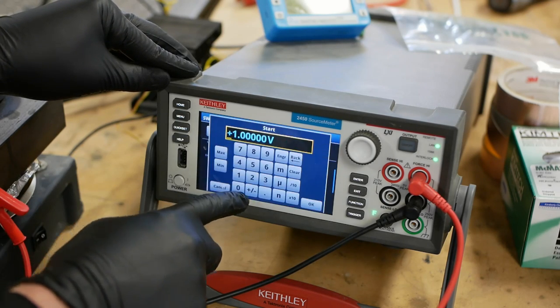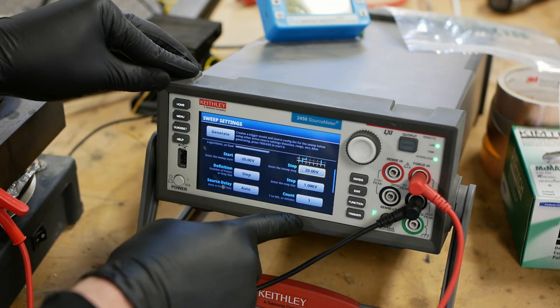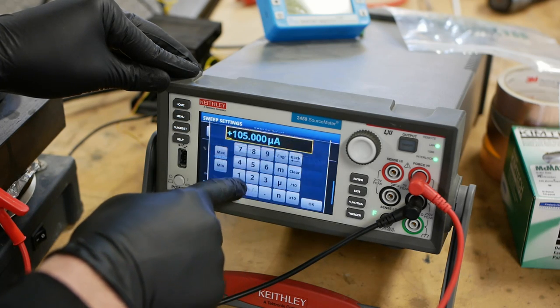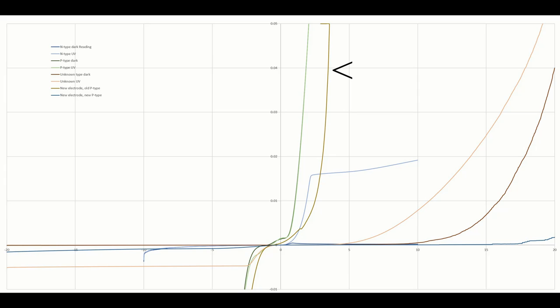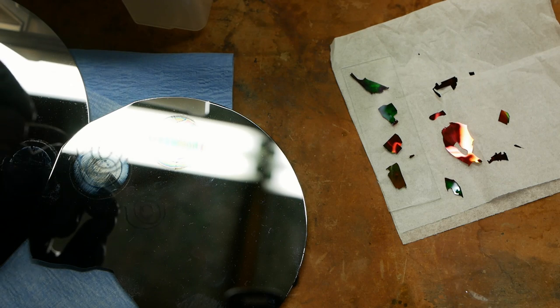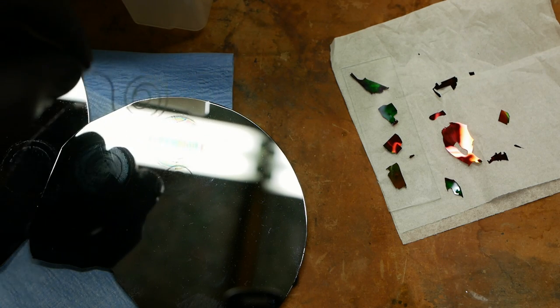I characterized a whole bunch of wafers by running a voltage sweep with this Keithley 2450, and recorded the currents at different voltages spanning from negative 20 to plus 20 volts. And the wafers that work really well have a very sharp response, so we can get a lot of current through them at a relatively low voltage. For this etching process, we want to shoot for between 10 and 100 milliamps per square centimeter of etching surface. So to get that much current through the wafer, we want it to have a pretty sharp curve. These wafers that are very gentle in their VI curves are tough to work with because we need to force 50 or 100 volts through them to get enough current. And by that time, we have way too much power being dissipated and causes all kinds of other problems. So as near as I can tell, the heavily doped ones are the only ones that work reliably.